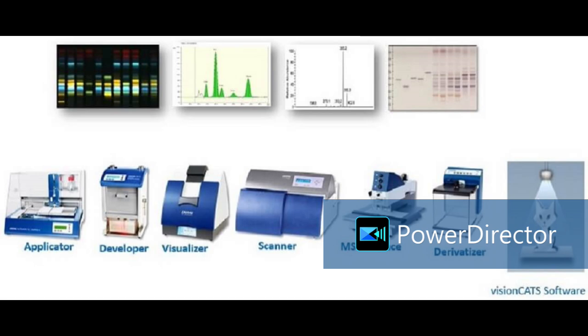Generally, ma'am said RNA, DNA, all these things are possible nowadays after putting in one machine. In nanoscale, technology has developed a lot, but in this era also chromatography plays a vital role for selectivity and accurate sensitivity. We are still using these good methods, and for different complex sample matrices we again need sample preparation and proper separation, and therefore HPTLC is still in good use by all the users in this sector.